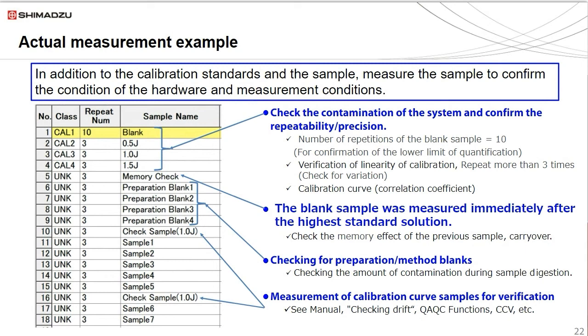Calibration check standards are also added periodically during analysis of unknown samples so that the accuracy of the system is monitored continuously. Not pictured are QA/QC functions where internal standard signal drift is monitored, and any drift here or in the CCV can trigger a recalibration or stoppage of analysis for troubleshooting.